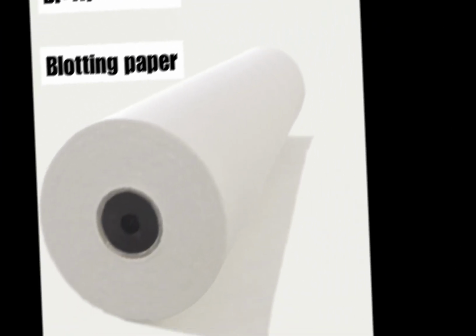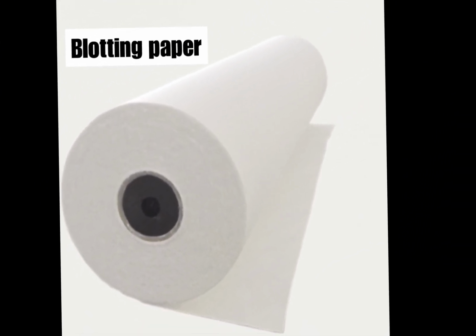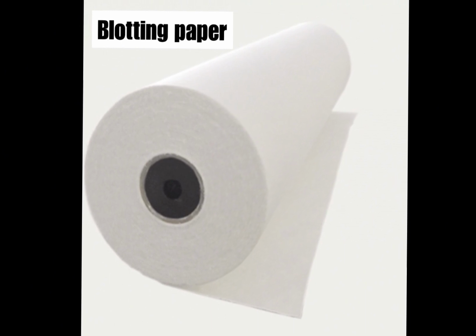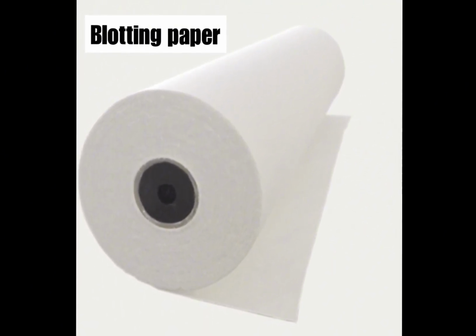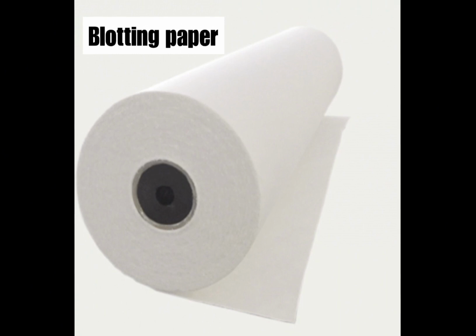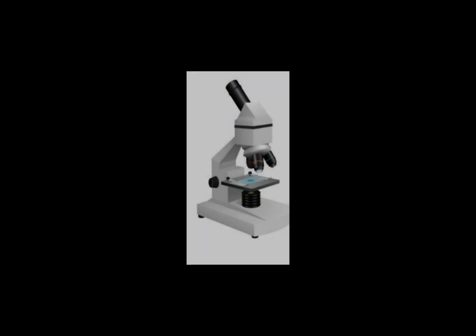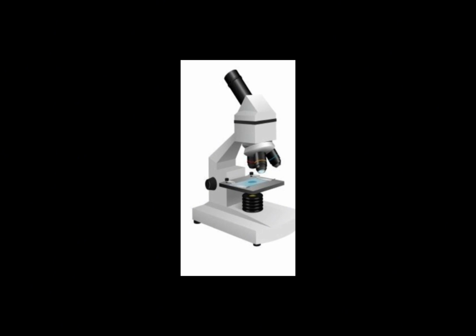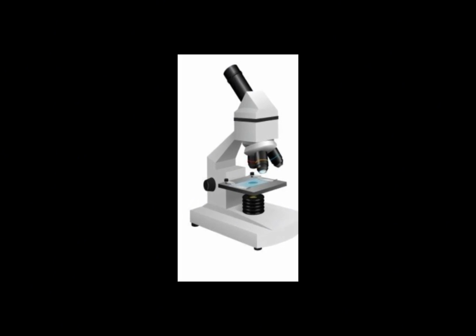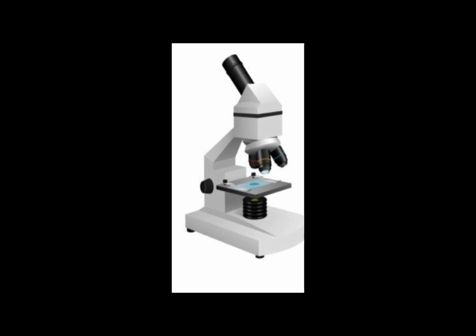The fifth step is we need to touch the blotting paper on one side of the slide to drain excess iodine or water solution. And then the sixth step is we need to place the slide on the microscope stage under low power and observe the cells. We need to adjust focus for clarity and observe.